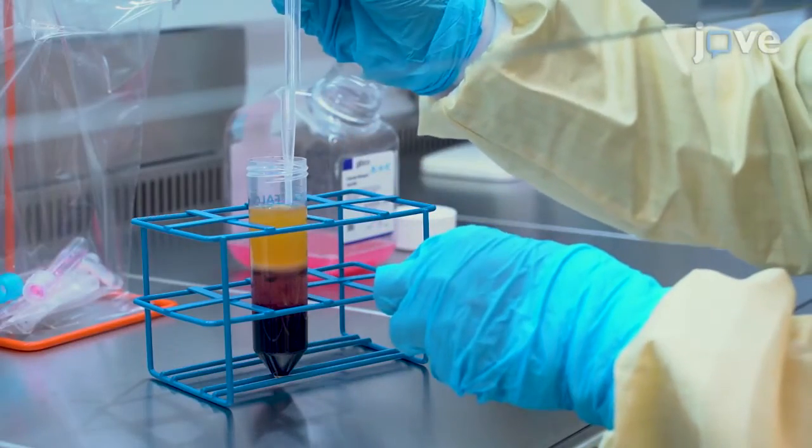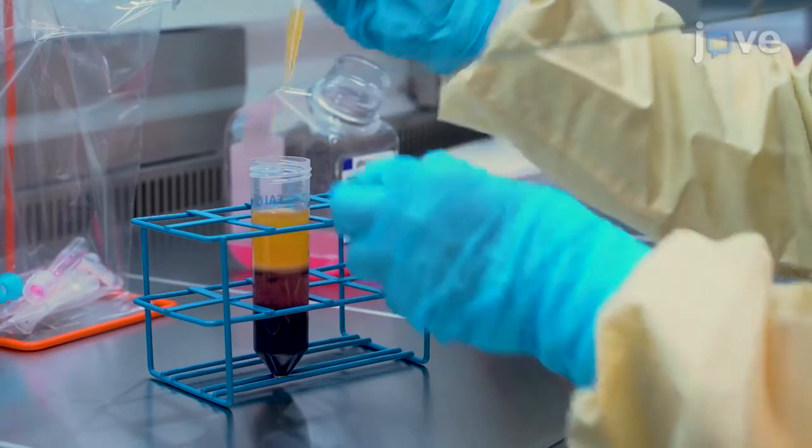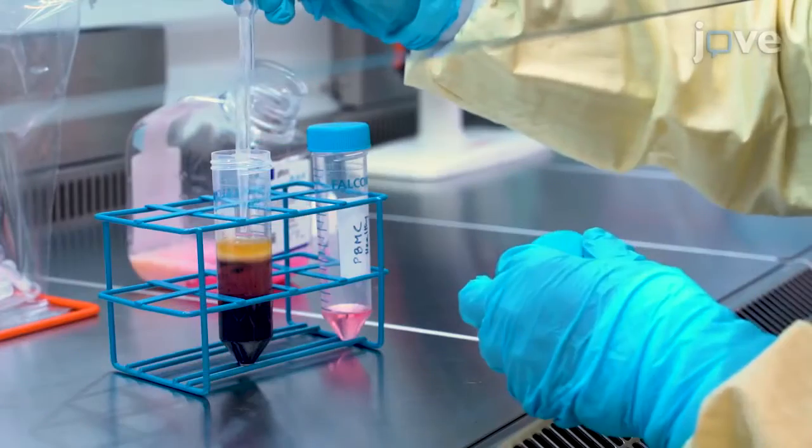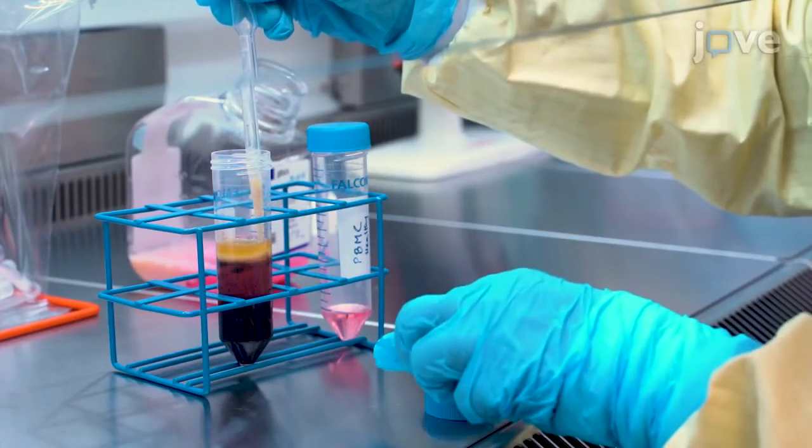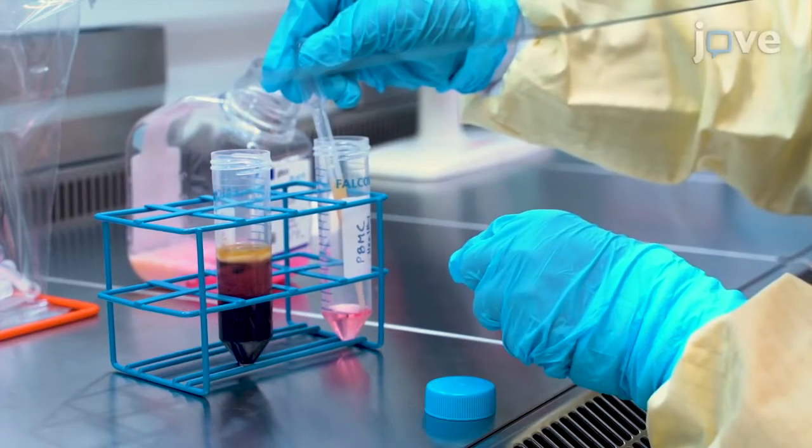Use a sterile Pasteur pipette to remove the top plasma layer and carefully transfer the mononuclear cell layer into a new 50 milliliter tube.